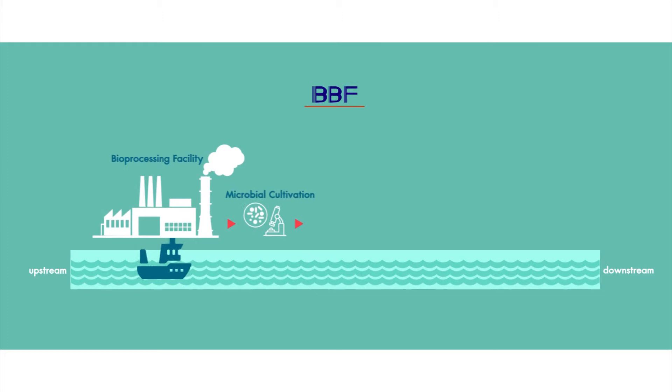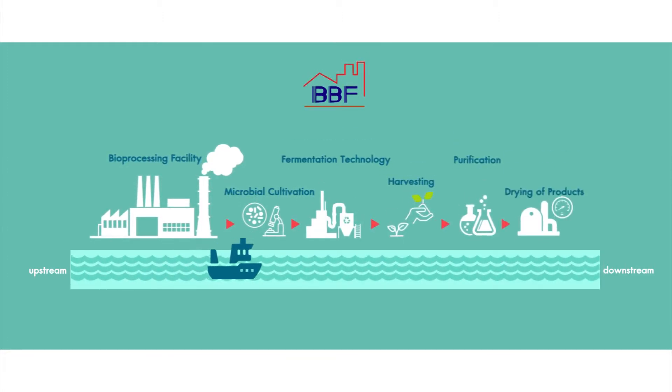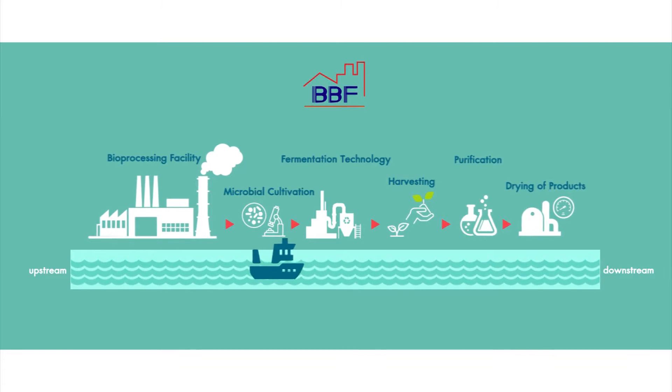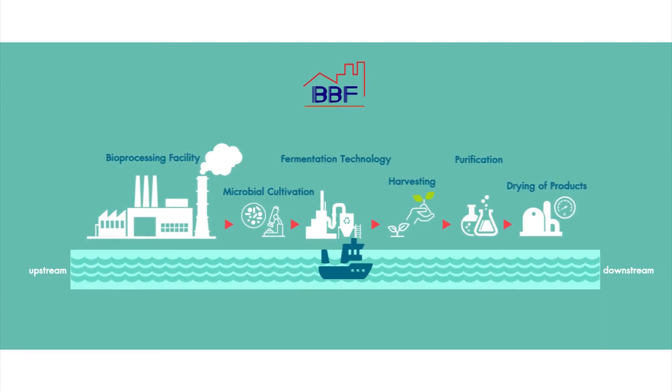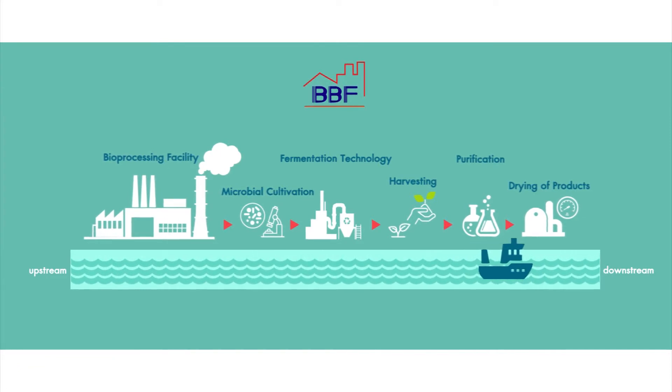The Bioprocessing Facility supports research activities on upstream and downstream processing, ranging from microbial cultivation by fermentation technology, harvesting, purification, and drying of products.